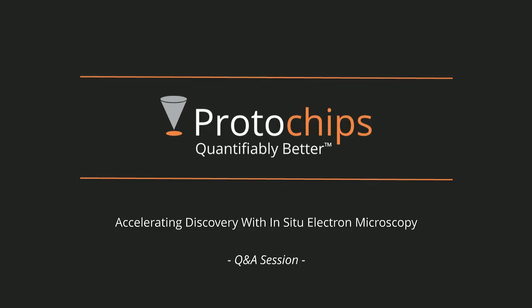Yeah, I guess I can answer that one as well. Sample prep, as anyone who's used an electron microscope or TEM knows, can be one of the more difficult parts. We would work with you to try to figure out how you could put those nanofibers on. There's a lot of drop casting methods that are possible, ex situ techniques, in situ, FIB lift-outs. There's quite a few different ways of doing it depending on the sample geometry and chemistry. But to answer the question in more detail, I think I need to know more about the fibers.